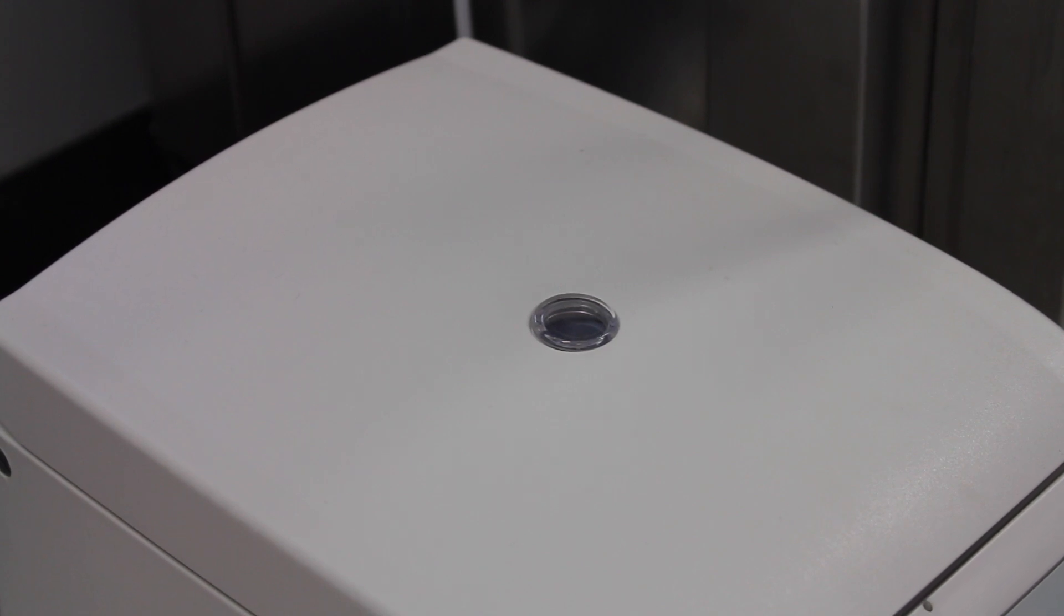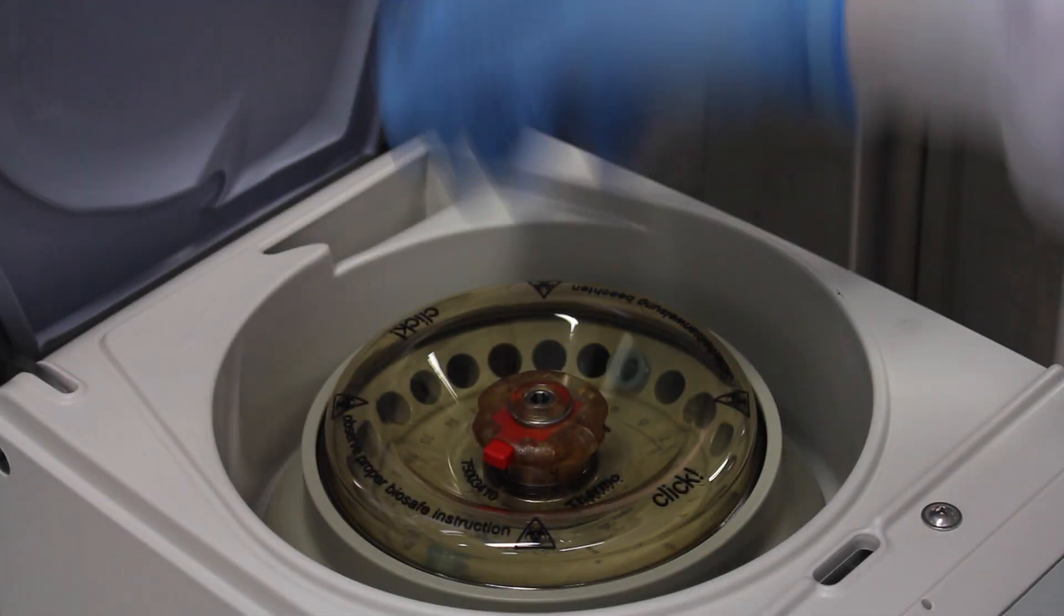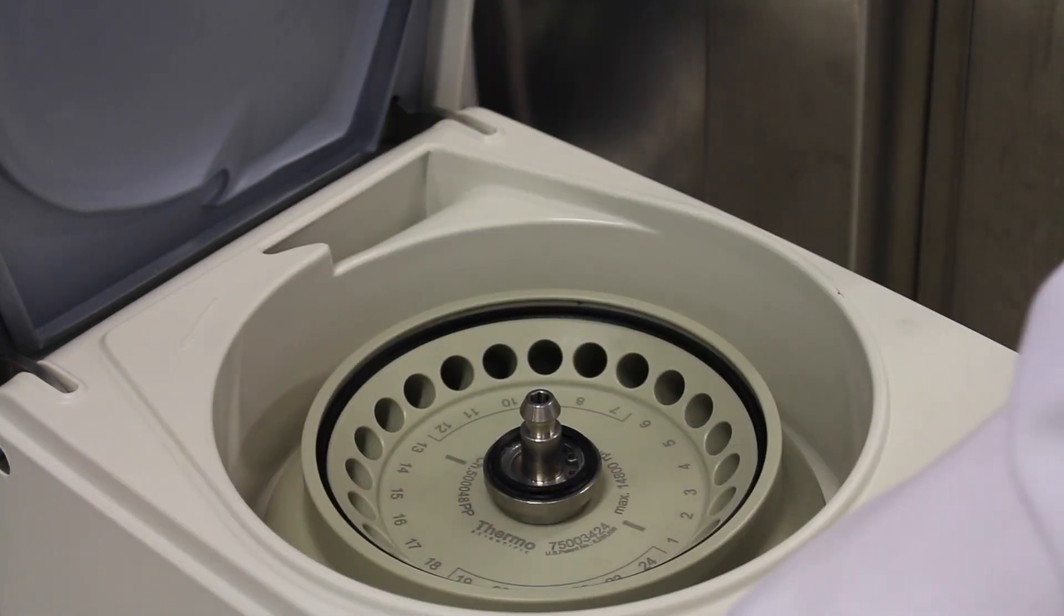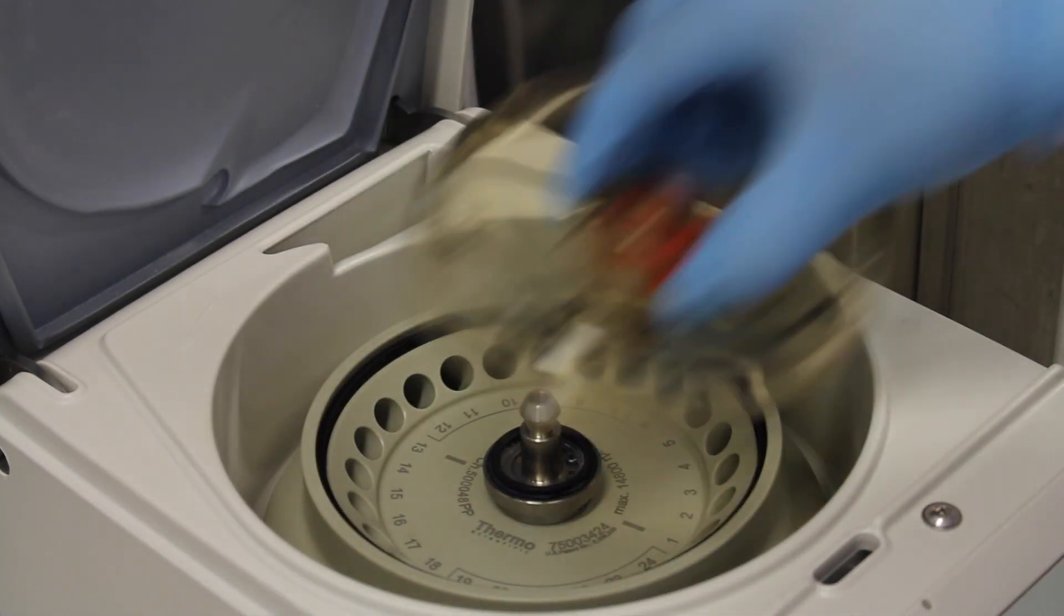In this tutorial we prepared two samples in order to balance the centrifuge. An alternative to this is to prepare one sample and to balance the centrifuge with a tube containing an equal volume of water.